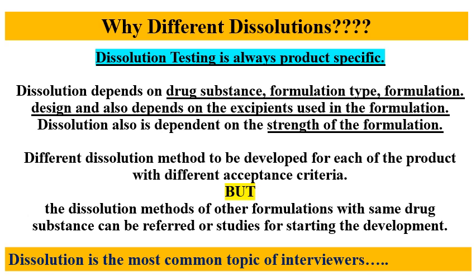So why are different dissolutions required for different formulations? As we have discussed, every formulation is specific and every formulation has some specific design.